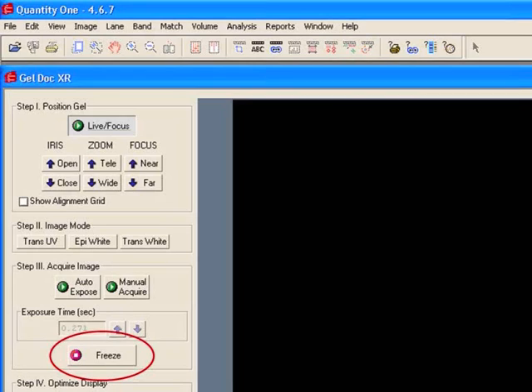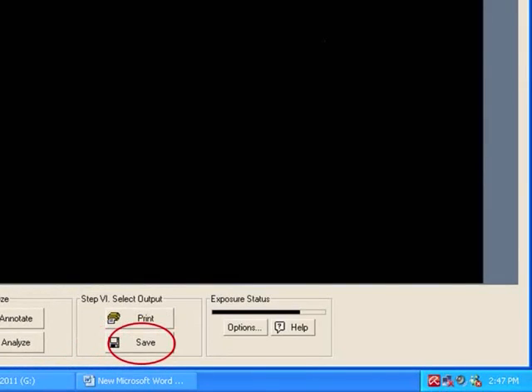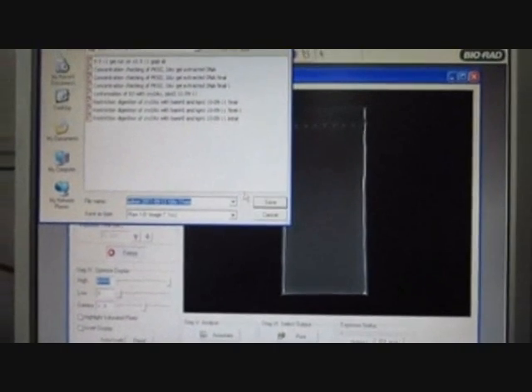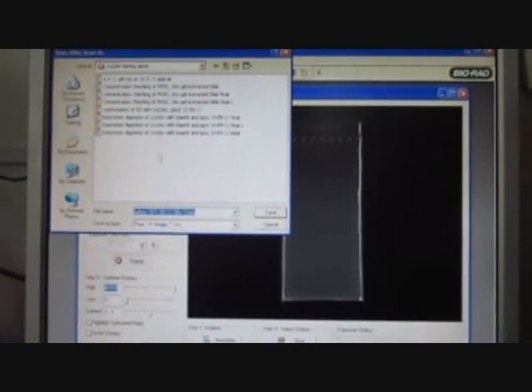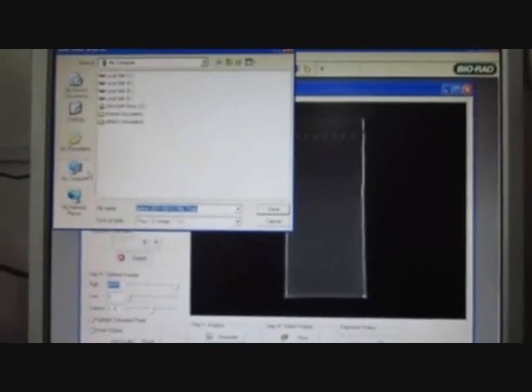When the required image has been obtained, the image can be frozen and printed. Once the image has been frozen, this can be saved in the designated folder indicating the name of the experiment, date, and all other details regarding the image.